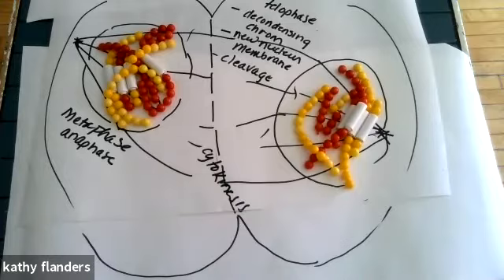All right, so look back at your book on page 58, and you can follow right along and see what I did. You can also look above on the pictures, and those are actual micrographs of a cell undergoing mitosis.